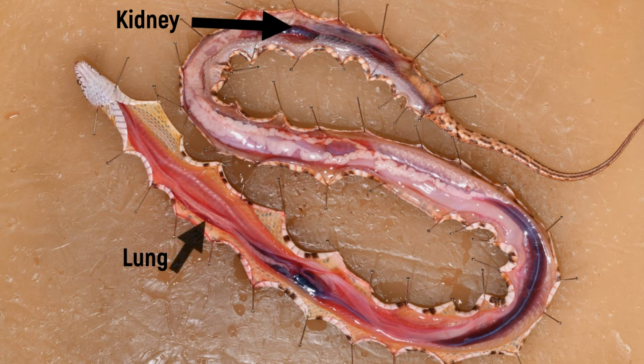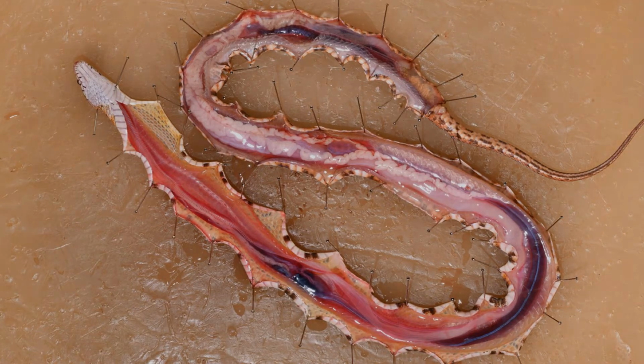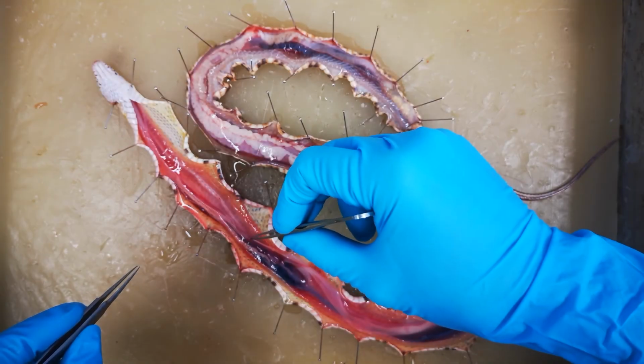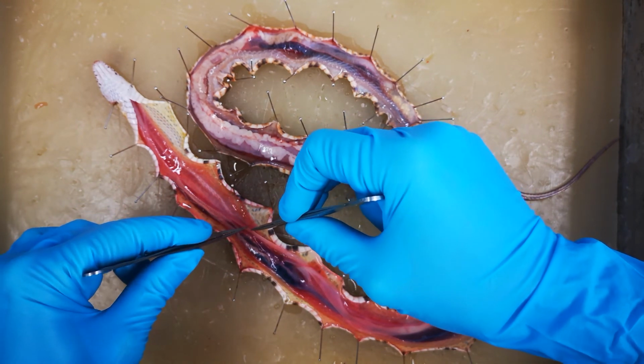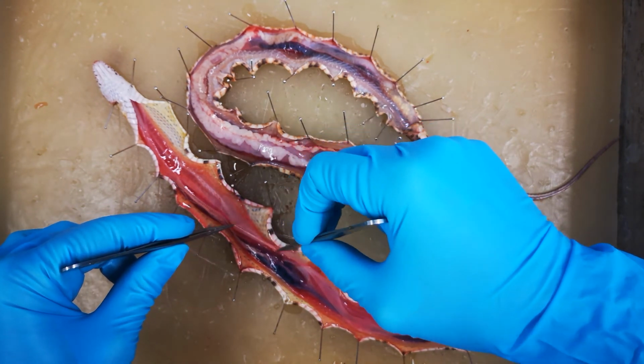Snake lungs are asymmetrical. One lung is large and elongated, while the other is reduced. In some species, the reduced lung retains its function, but in others, it is lost altogether. To see the organs better, we can open the peritoneal membrane. We can then cut the mesenteries that connect many of the internal organs.